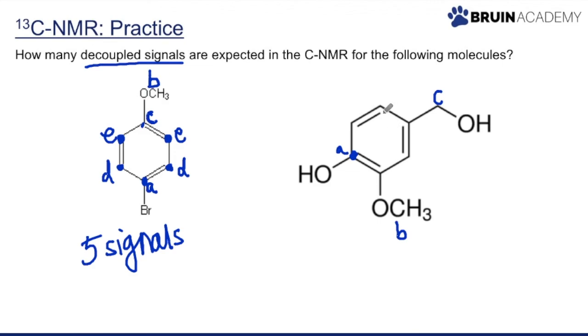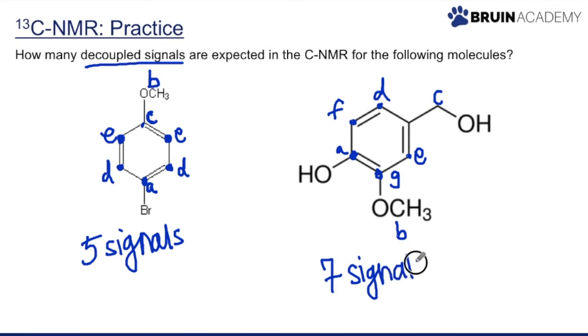And again, you might be tempted to look at the benzene and make these 2 equivalent here and here, but in fact they are not. So this will be D, this will be E, this will be F, and this will be G. So I kind of labeled that out of order. Sorry about that. But here we have A, B, C, D, E, F, G. So we'll have 7 signals being registered here. Actually, excuse me, 8. There's one more right here, H. So we'll have 8 signals.